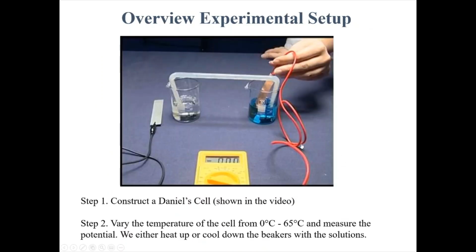Okay, so how are we going to get delta G? Well, we're going to get delta G by building an electrochemical cell and measuring the E cell. So let's see how we're going to build the cell. The good thing about this lab is that we would actually set this demonstration up exactly as it is in this video. A few minor changes, but exactly as it is in this video. And I will highlight the changes to you. But you wouldn't actually do this experiment, you'd watch us do it anyway. So you're not really missing out on anything, and you're going to get a chance to see exactly what we do.